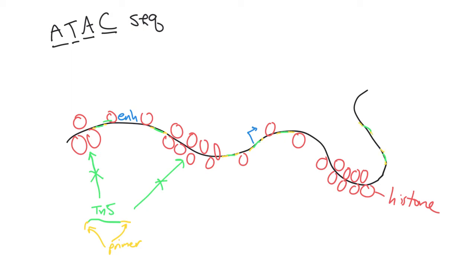So let me diagram that. What happens is PCR primers are used to target, for example, a forward primer in that transposon, and a primer target in that transposon. So essentially, PCR is conducted that amplifies lots of copies of the DNA that's in between the transposons.